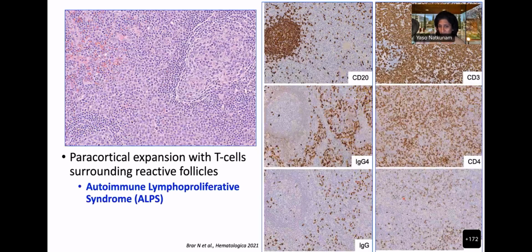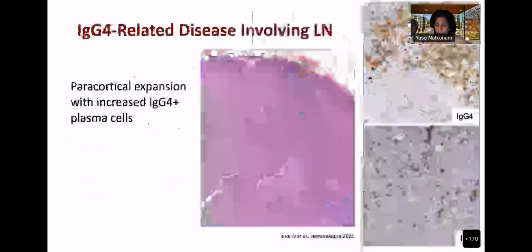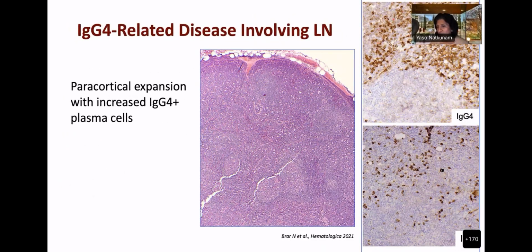This case is pretty clear because as a ratio, where is it? Oh, sorry. As a ratio, where did it go? I'm sorry. Yeah, as a ratio, it looks more than 40, 100%, because the IgG isn't actually picking up that much. So the denominator here is a little off. It should have at least as many cells.